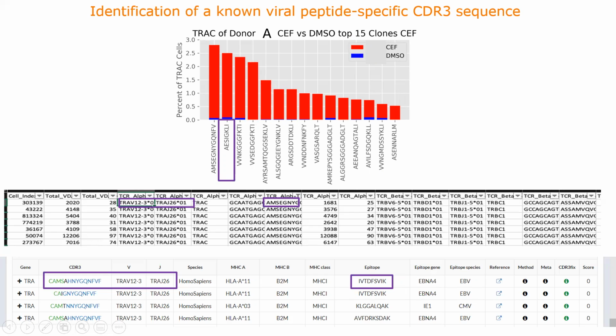In conclusion, the VDJ assay in combination with Ab-Seq and Sample Tag can help identify activated T cell clusters and activated TCR clones. We were able to detect enriched clones and quantify their enrichment levels.